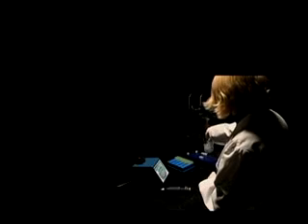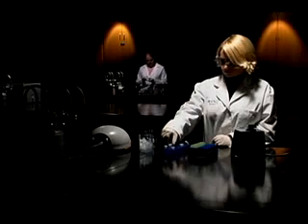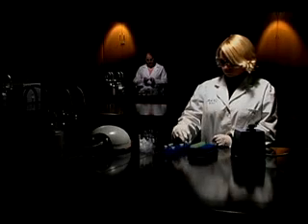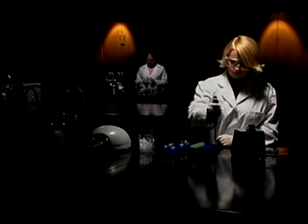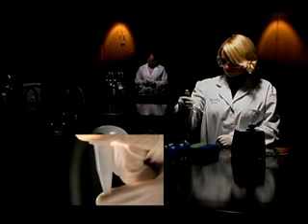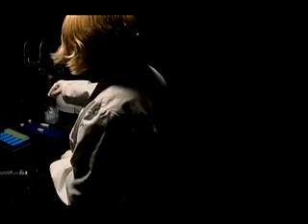Keep the solution on ice for 5 minutes. Add potassium acetate neutralization buffer using a pipette. The acid will neutralize the basic sodium hydroxide, and the cold will cause potassium salt to precipitate, removing the SDS from the solution. Cap the tube again and mix it thoroughly. You should see a white precipitate form. This precipitate is made up of SDS, cell membrane fragments, proteins, and large amounts of chromosomal DNA, which is attached to the membrane fragments. Ice the tube for 4 more minutes.